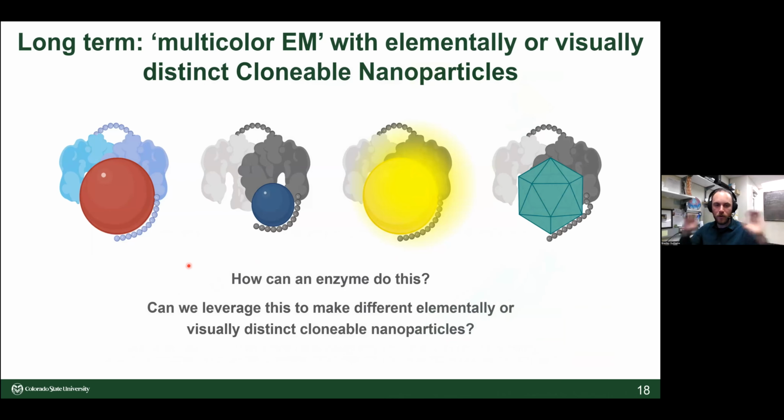So, okay, I've told you a lot about electron tomography. This is a single particle cryo-EM webinar, right? So why am I doing single particle cryo-EM when we've got something that's working? We have bigger goals here. With green fluorescent protein, there's a whole toolbox of variants that express different colors, so you can do simultaneous localization of multiple species of interest.